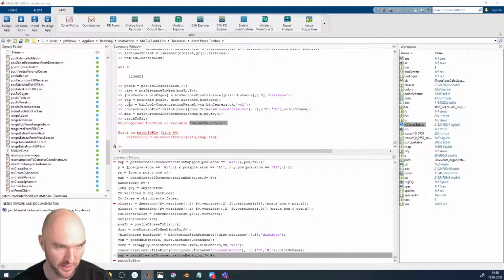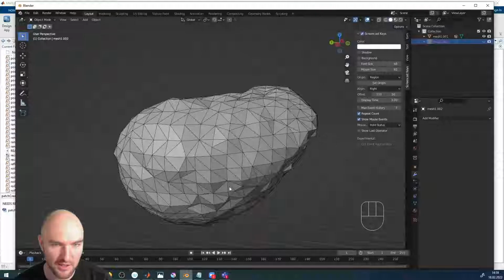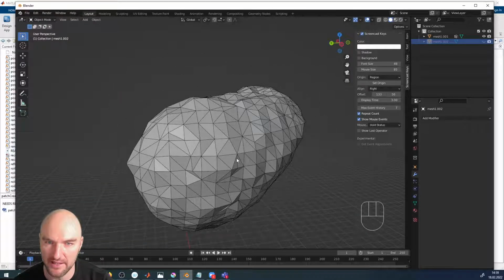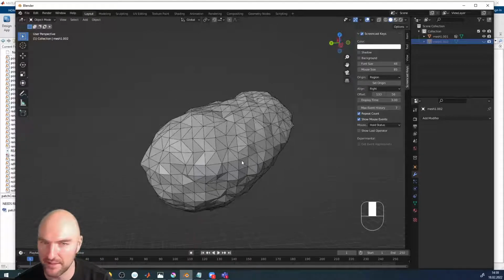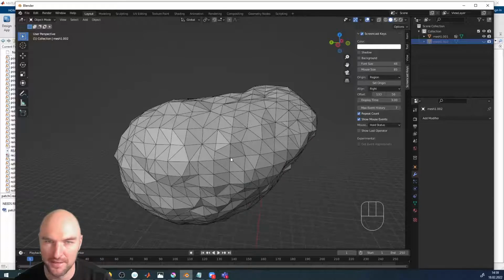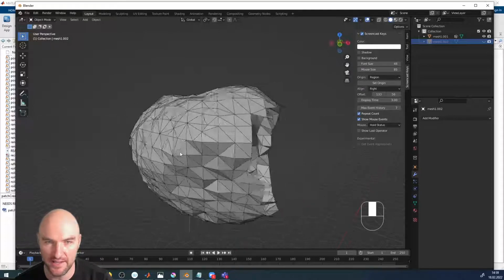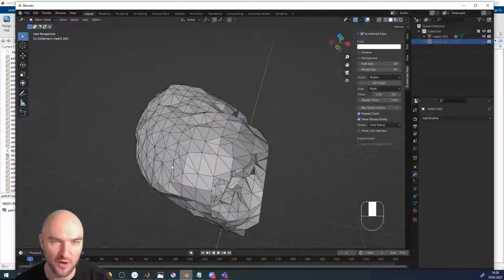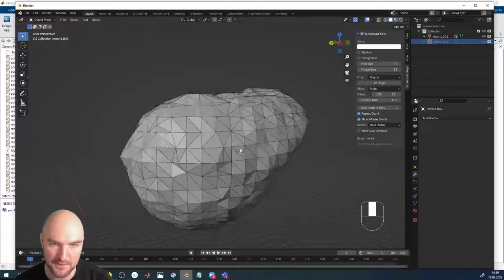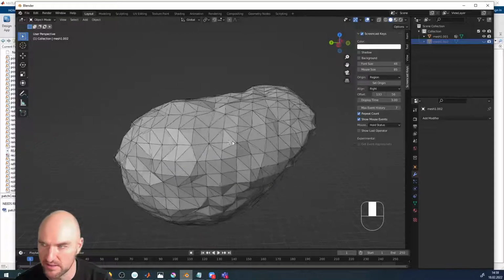Okay, with that, we are at the end of this part of the session. I really hope you now understand how to create local proxigrams, and in the future we'll make it a little bit easier. But you should have understood by now how it works. You can mark certain parts of the surface, and you can calculate concentration maps of isosurfaces of any analysis objects that you have created.